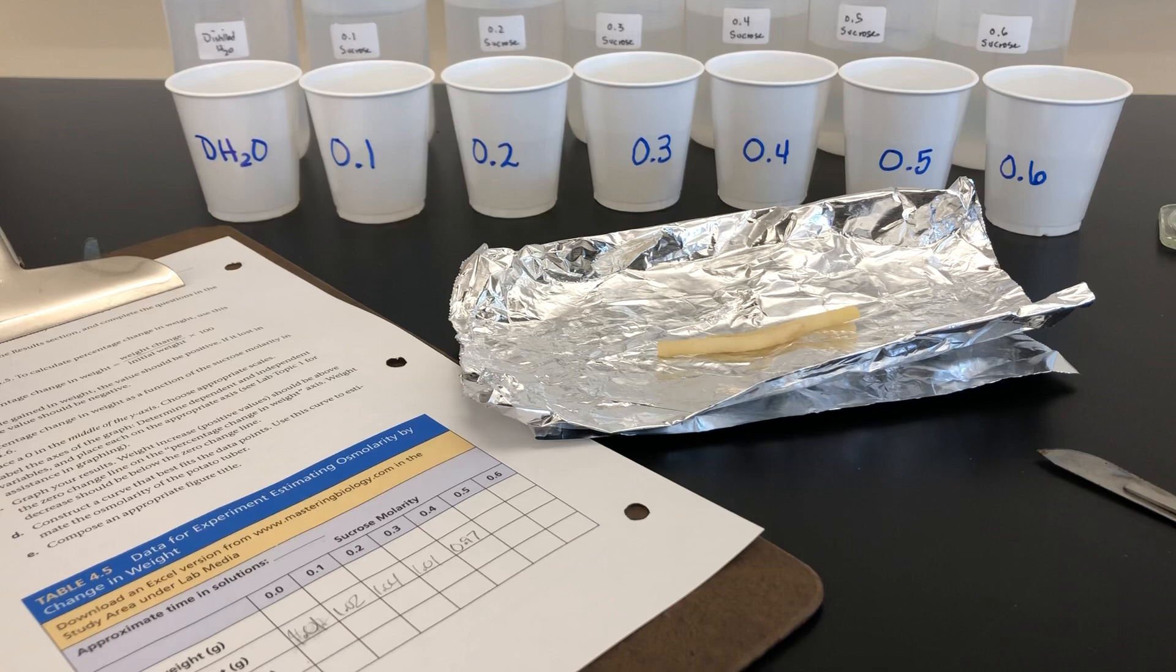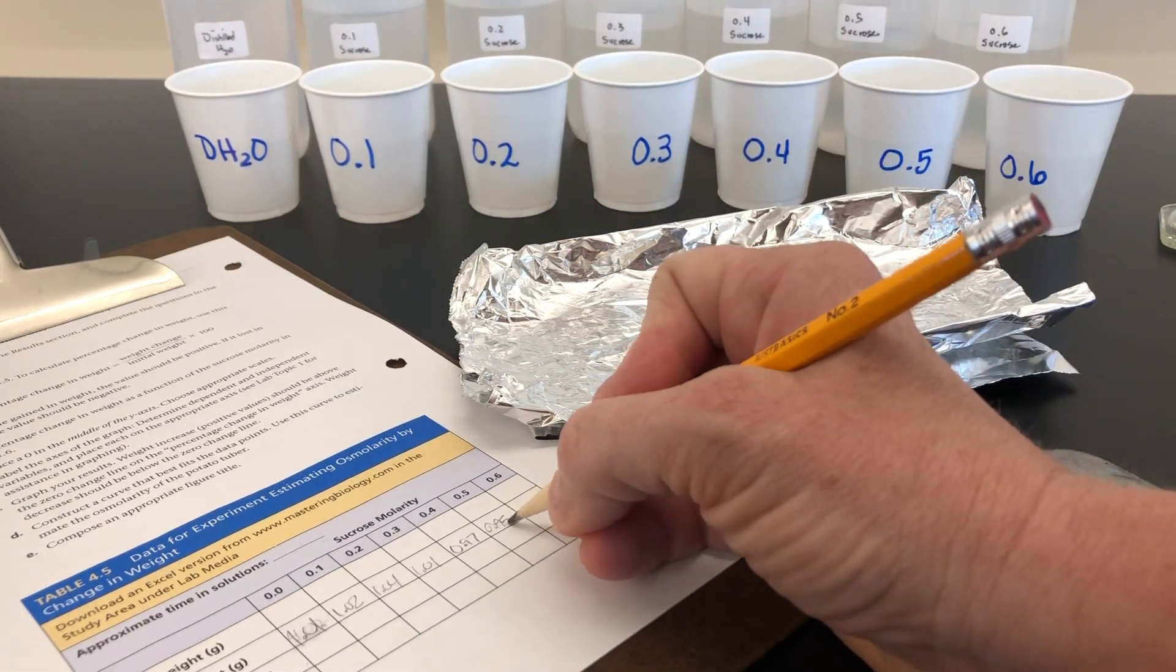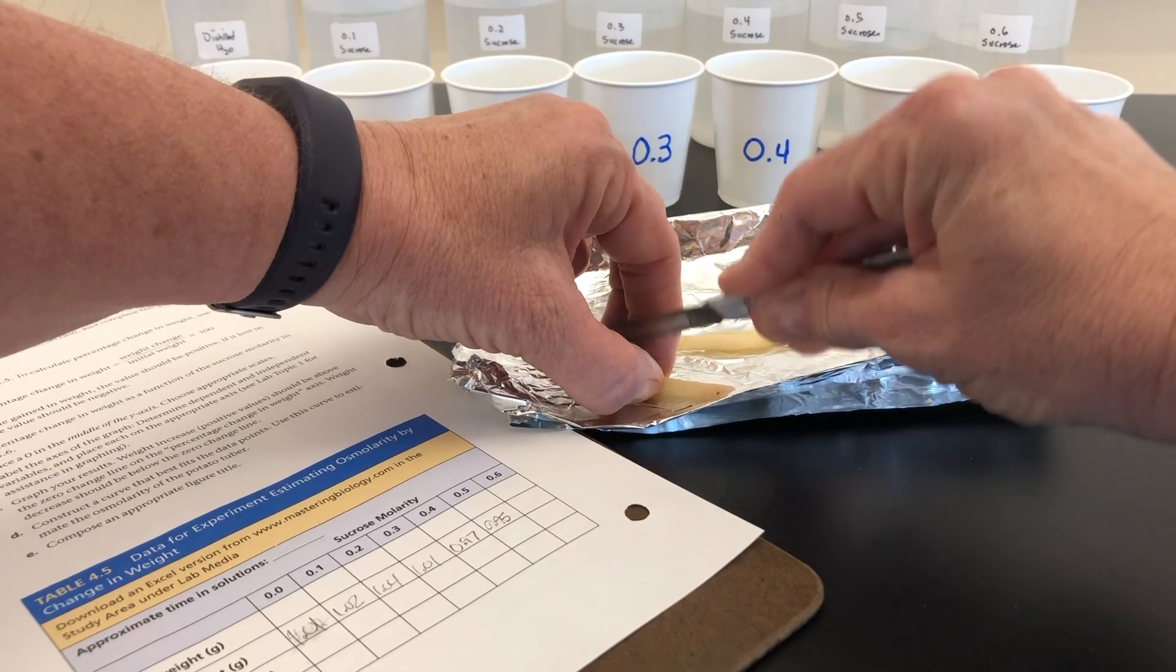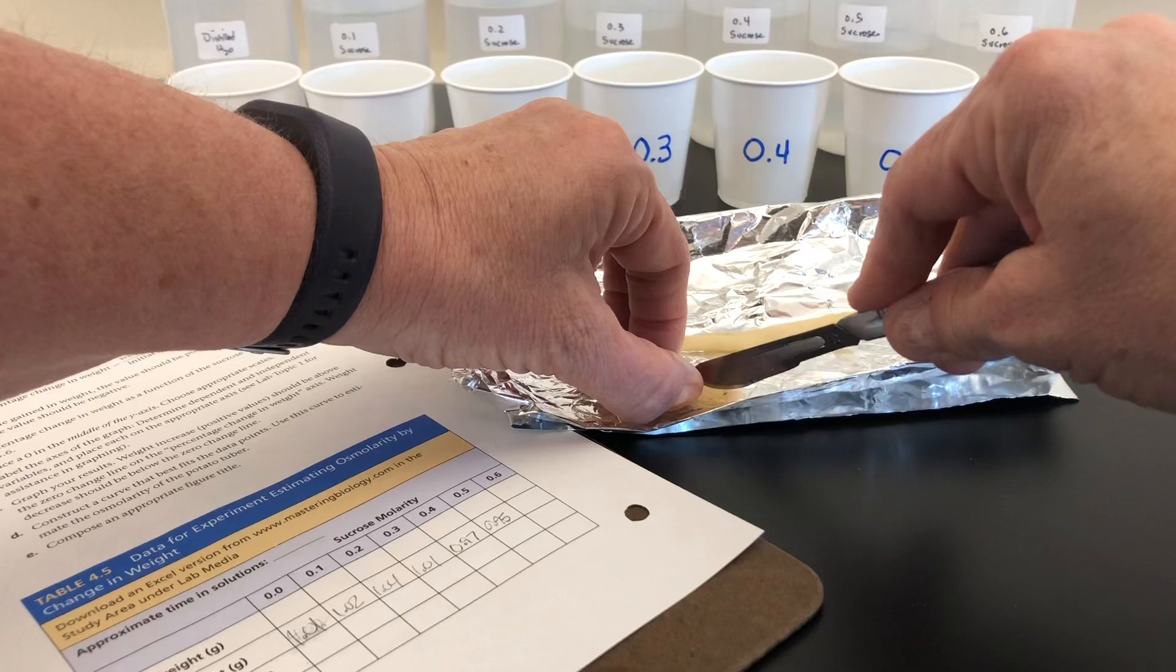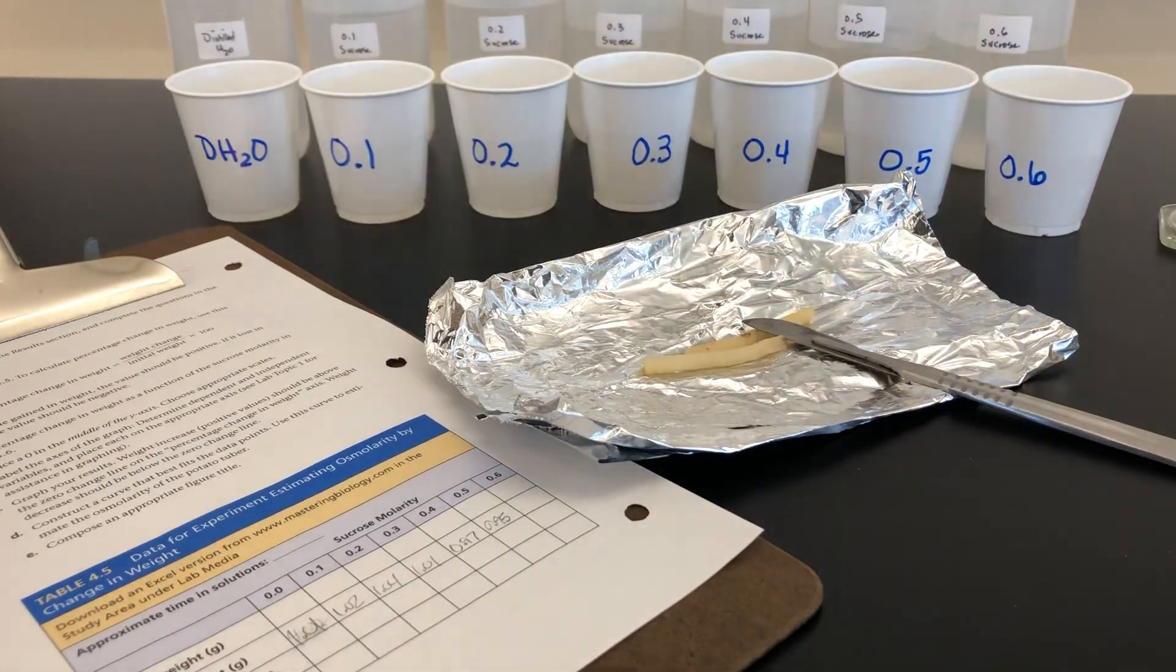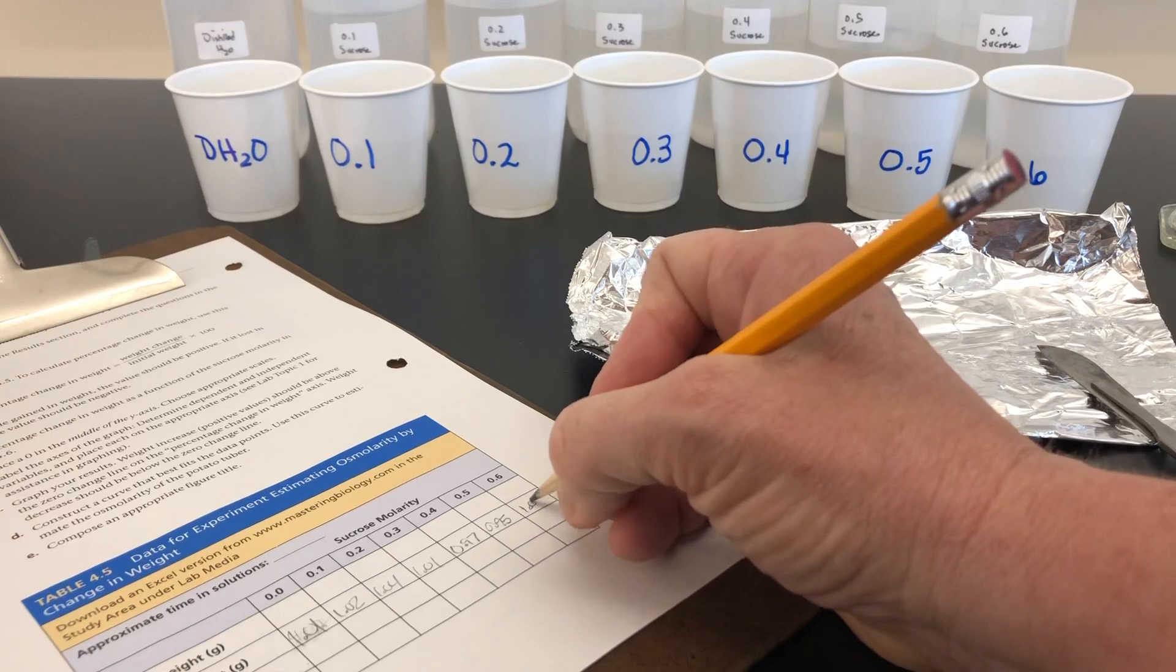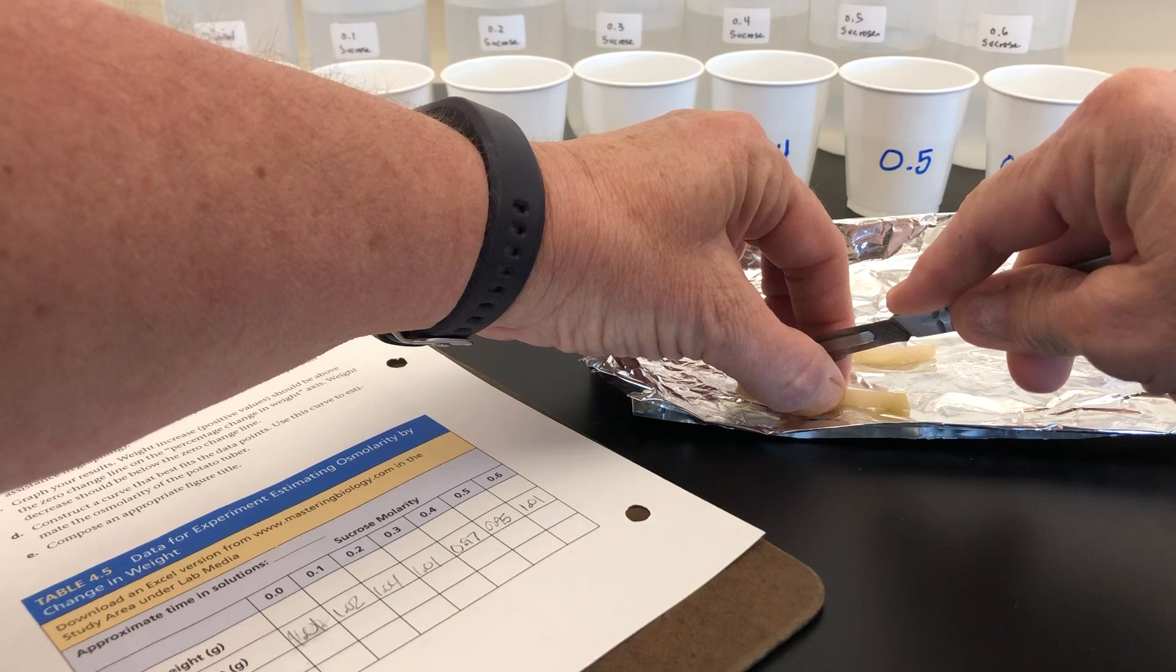The 0.5 solution is going to have a potato weighing 0.95, and lastly, 1.01 will be placed in the 0.6 solution.